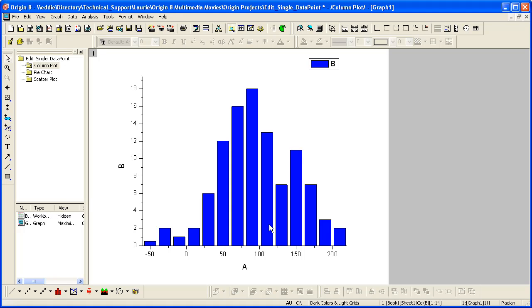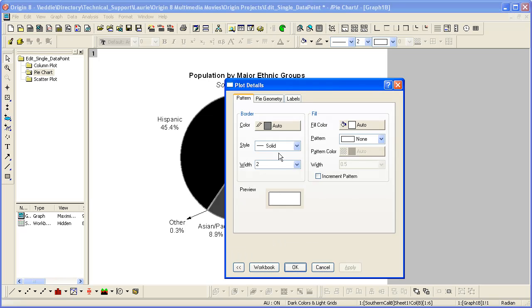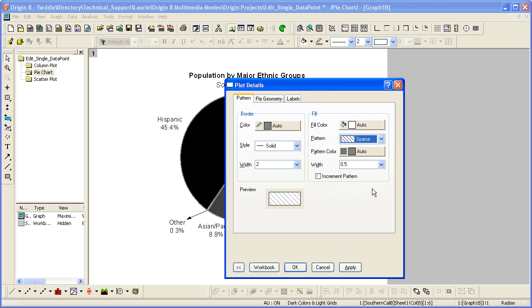Another graph type where the editing of a single point is useful is a pie chart. Again, the trick is just to hold down the control key while double clicking on one of the slices. We can then set a pattern for that particular slice.